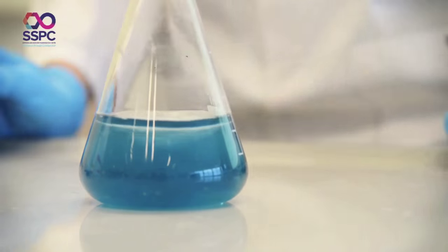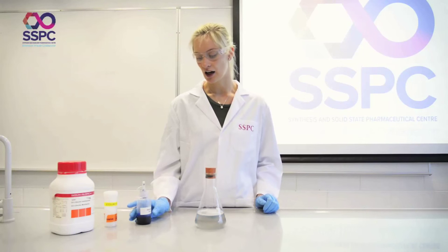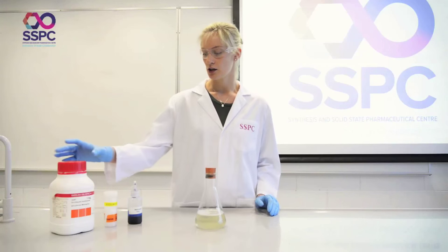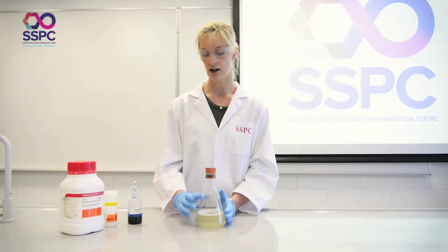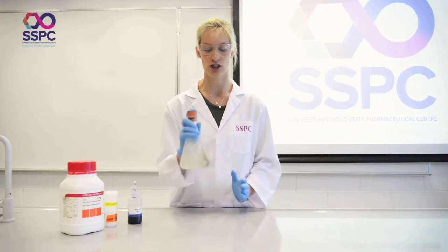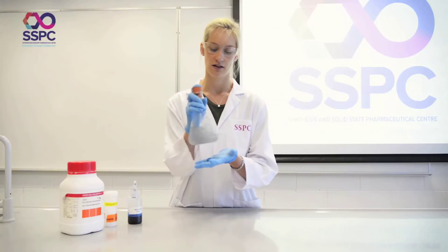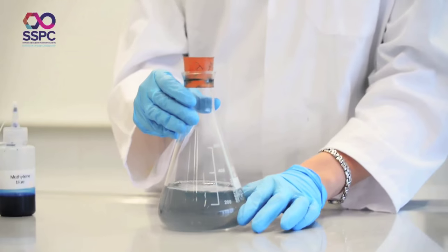What we have is glucose in a concentrated solution of sodium hydroxide and methylene blue. Methylene blue is an indicator — it is colorless when in a reducing environment and blue when oxidized. The glucose acts as the reducing agent and is itself oxidized to gluconic acid as we shake it, bringing oxygen from the air into the mixture and causing the color change. As the oxygen comes back out of solution, the methylene blue reduces back to its colorless form.